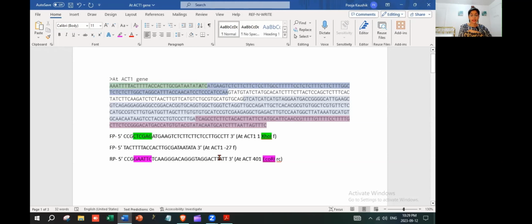And then one more thing I wanted to mention is why do we need to know the actual sequence? So as I gave you the example for designing another forward primer from the 5' UTR, if you do not keep the information about the sequence that you included in your insert, you might miss including this sequence when you check the enzyme sites in your insert.